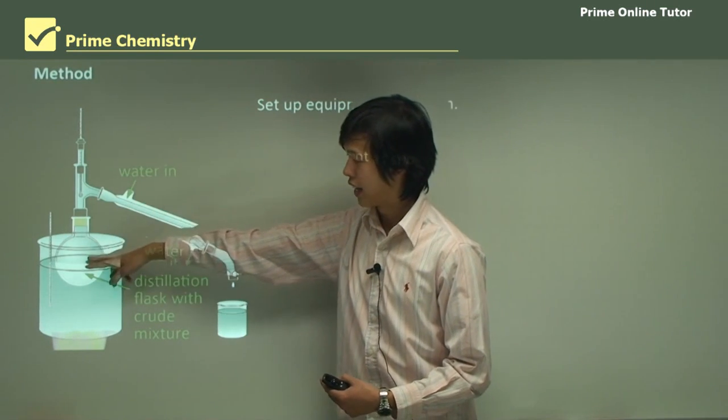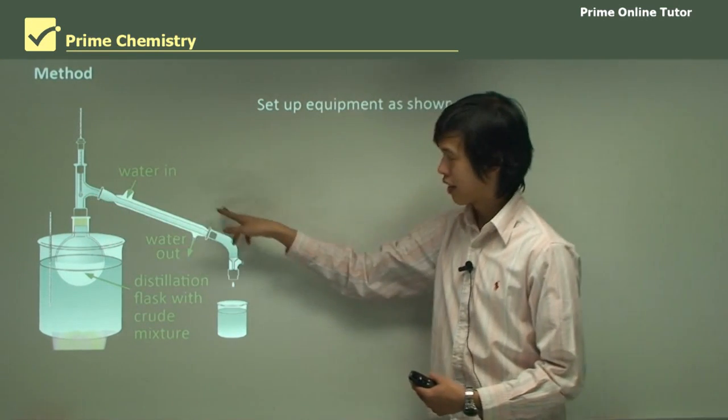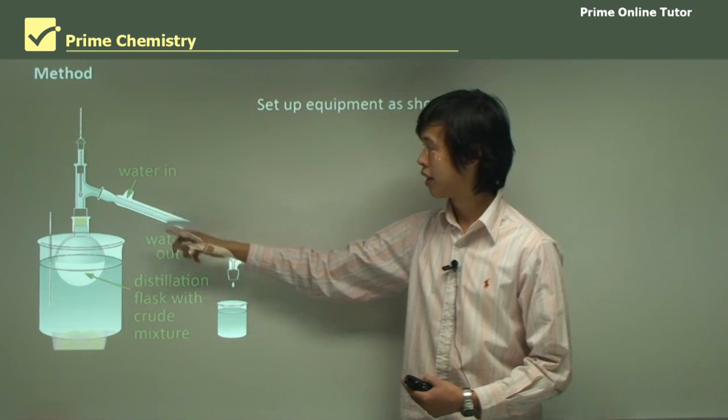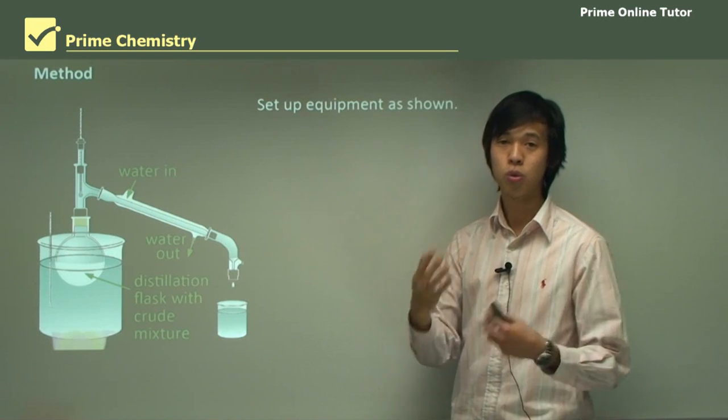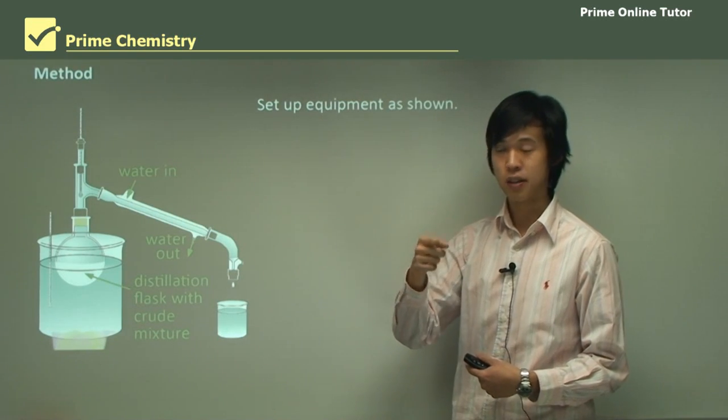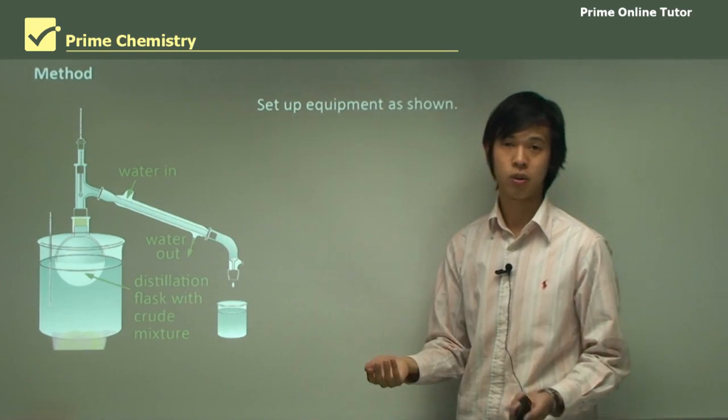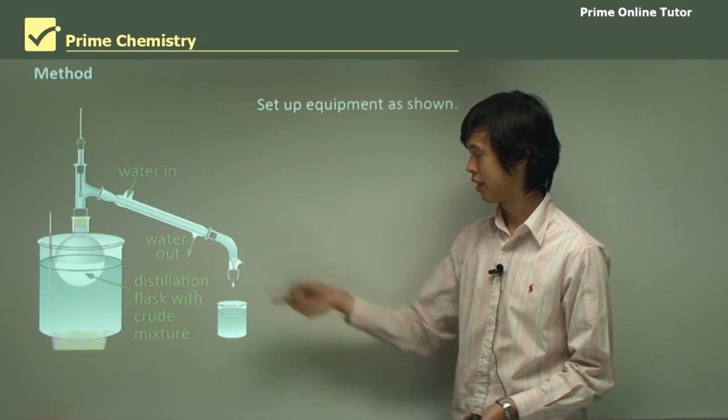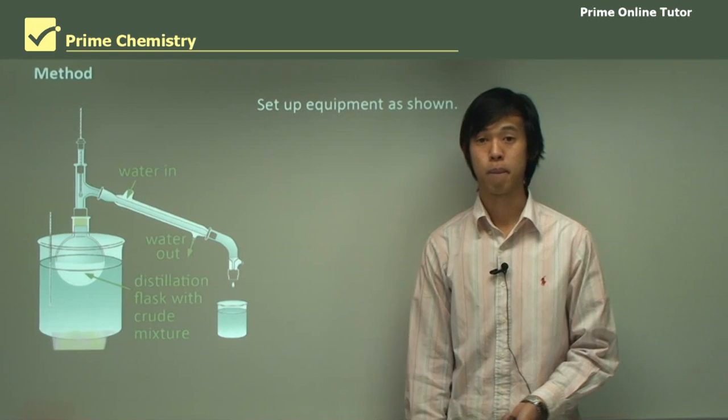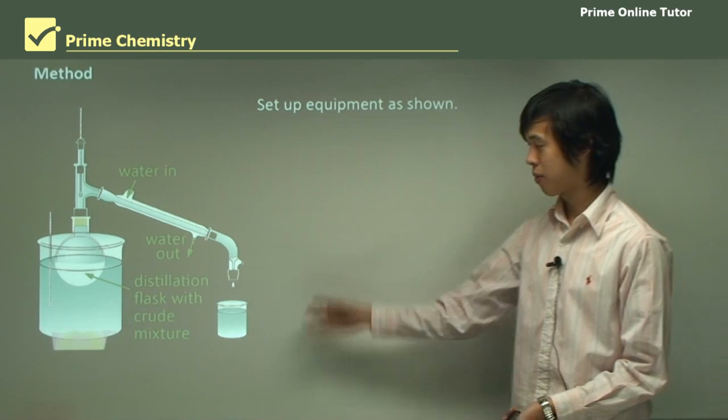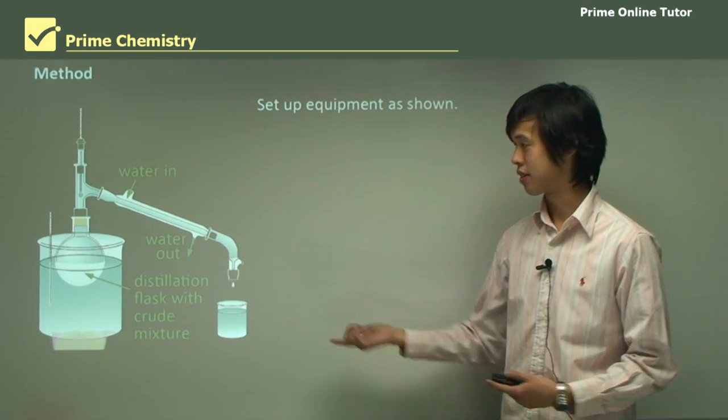And so here is our distillation flask and the crude mixture we're talking about is just our ethanol water mixture. So we're just going to pour all our mixture in here and then heat it using this water bath and Bunsen burner. Now when it evaporates it comes up into here, our condenser tube, and our condenser tube essentially has cold water flowing around it, which will cool the inner part of this tube which will then cause the gases to condense. Then once they condense they'll drip down into our collection beaker down there.